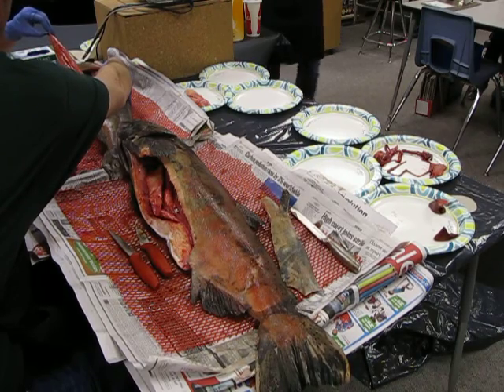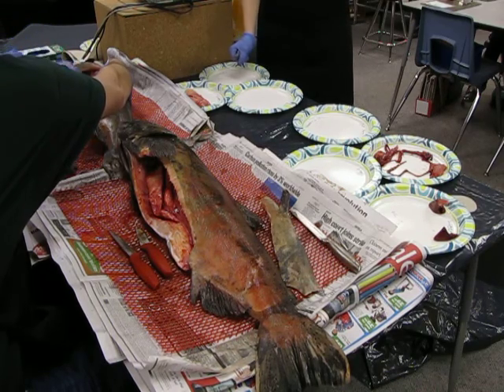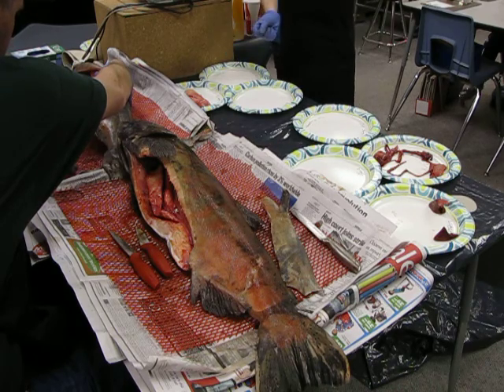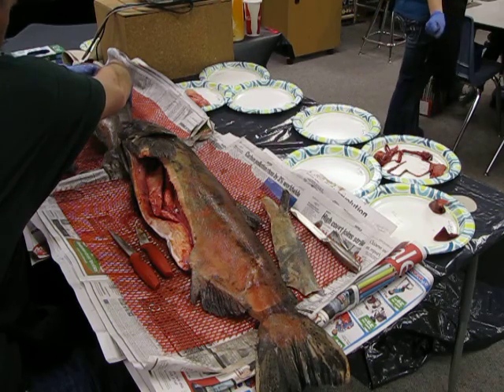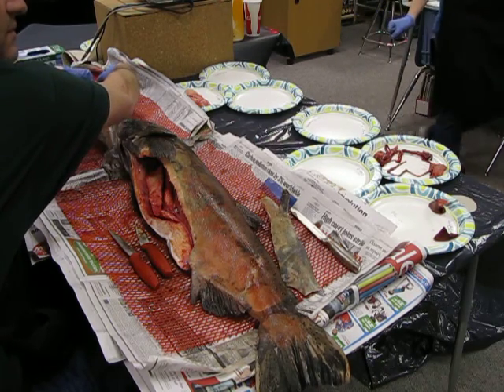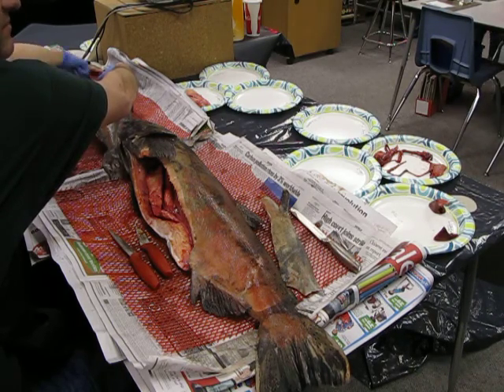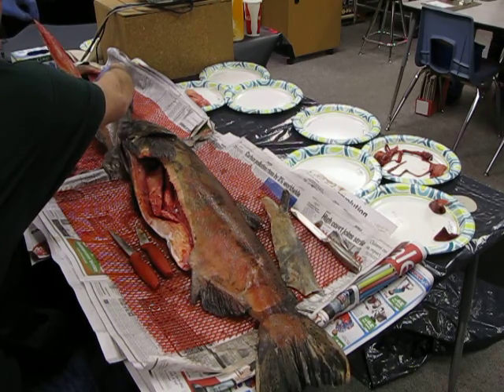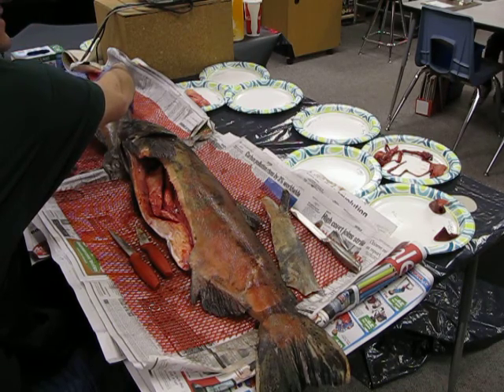All right. It looks like we're working on a swim bladder. Who knows what the swim bladder does? Why is it important for a salmon? What is a swim bladder and why is it important? We talked about it. What do you think? You know, if you go up or down, they hold the water inside. So Miguel's saying that it helps them go up and down in the water, right? What else? It helps them keep their balance. It helps them keep their balance too.